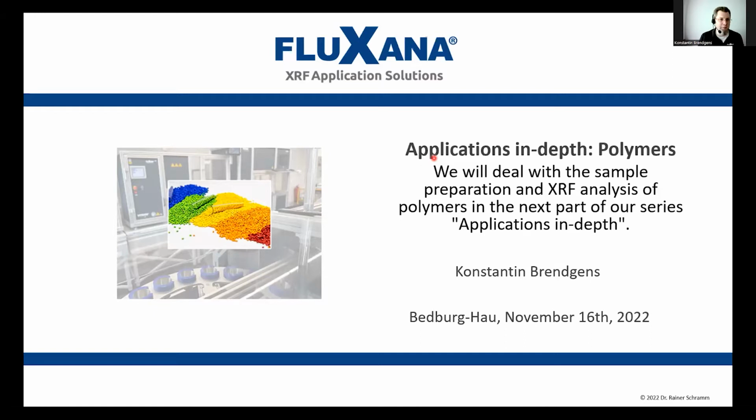Today in our application seminars, we'll talk about polymers and how to analyze them with the XRF. And we'll go over a few examples and some general things to know and think about when it comes to analyzing these kinds of materials.